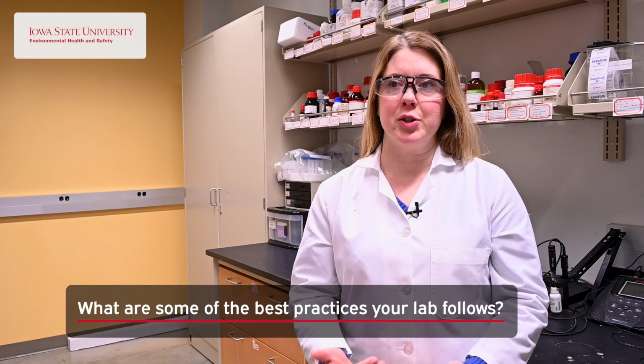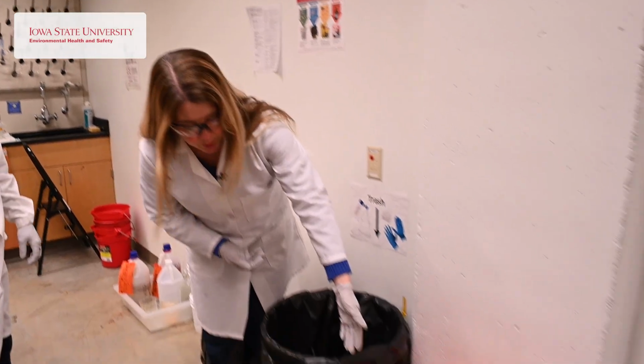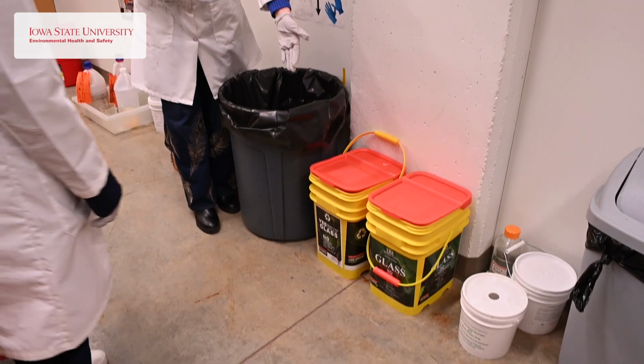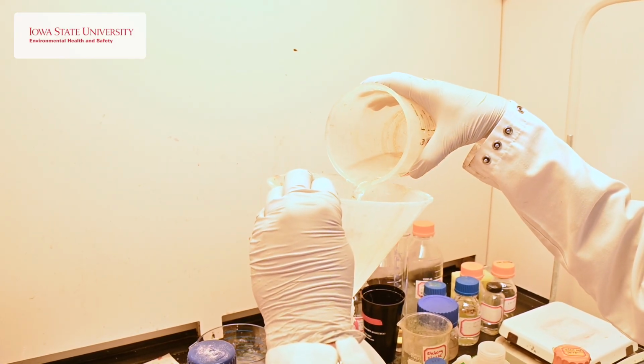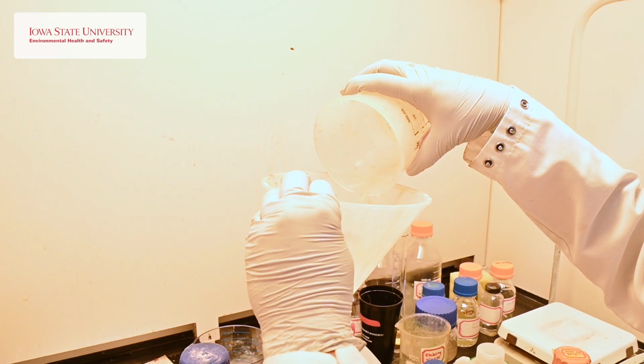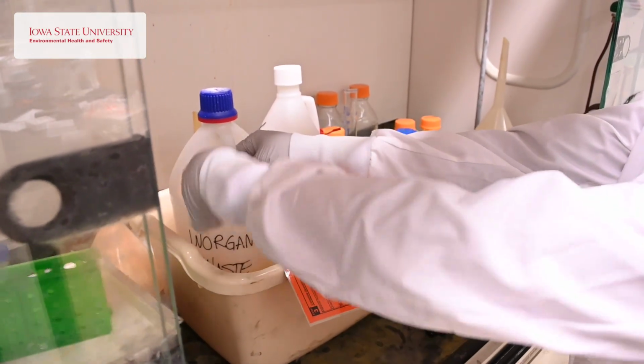An important best practice for our lab in terms of waste management is making sure that we onboard new students appropriately. So they receive both general training about waste and waste disposal, as well as specific safety training for our lab. There are certain classes of waste that we generate that would be a lot more dangerous to mix inappropriately. So we make sure that they're trained, as well as they sign a document to keep a record that they've been trained.